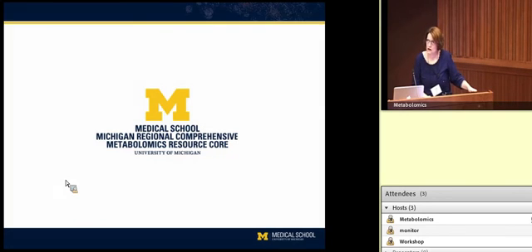For that untargeted analysis, how many of the metabolites are really known, and how accurately can you predict that those are known metabolites? It depends on the matrix, and we're continuously working on that. At the moment, if you combine all of our platforms, LC, GC, and HILIC LC, we call the first one reverse phase LC because that was our first one. If you combine all those, we're probably looking at something like 300 named compounds, sometimes a little bit more. We're continuously working on that. I think that number is going to come up pretty soon.